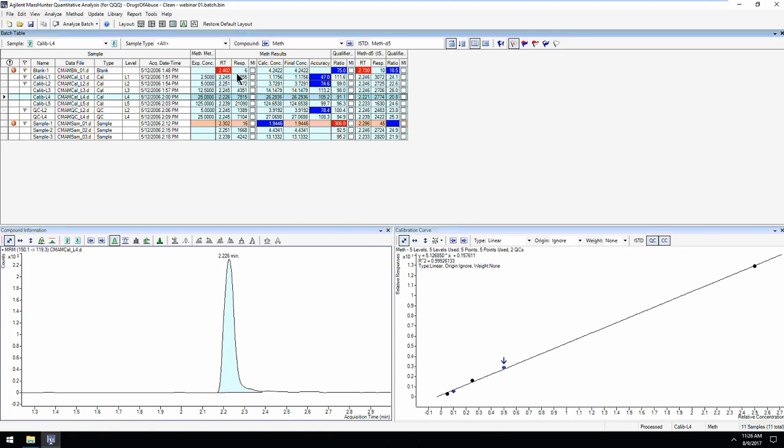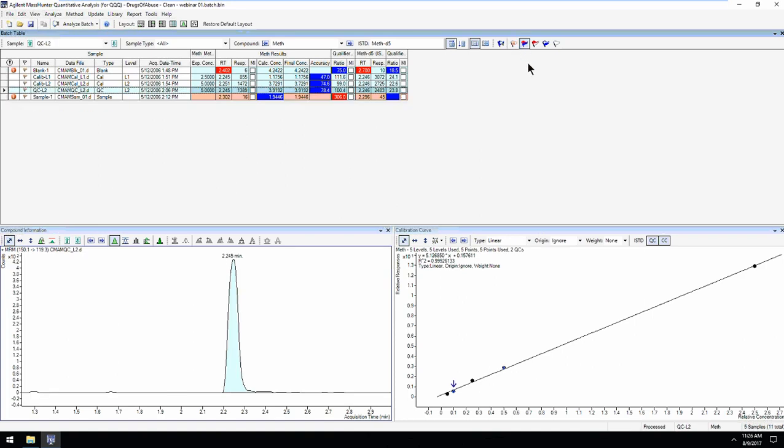The outliers are a nice feature. You can see here for this particular compound, we've got a few outliers. Hovering shows us why it's showing that as being a high outlier in the red. Retention time's a little further out than it would expect. Well, that one's a blank, so probably not there anyway, just latching on to something. We've got a couple of blue outliers. This is a little below where it's expecting to see that standard, so probably something we want to dig into there.